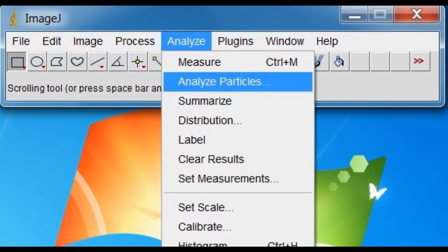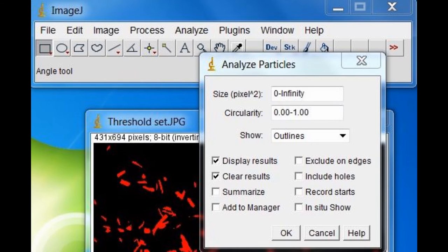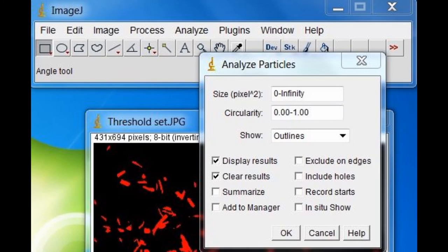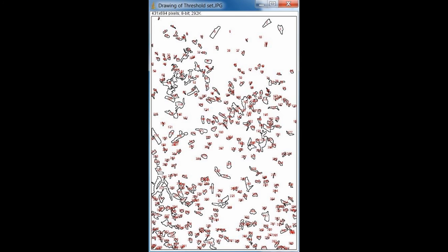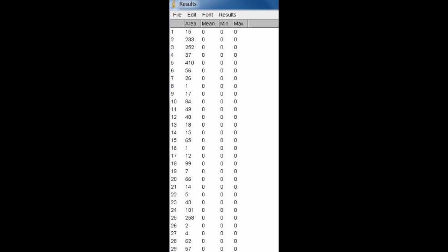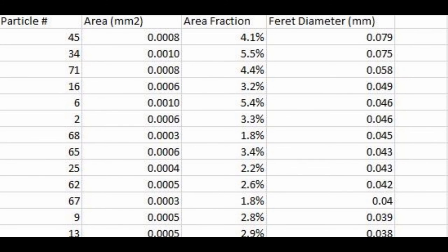First select Analyze, Analyze Particles to gather information on particle size and number of particles. If there are outliers, set the minimum and maximum to the desired amount to avoid tiny specks of dust being analyzed as well. Select the Show Outlines option to display an image of the detected objects with their outline and the corresponding particle number.